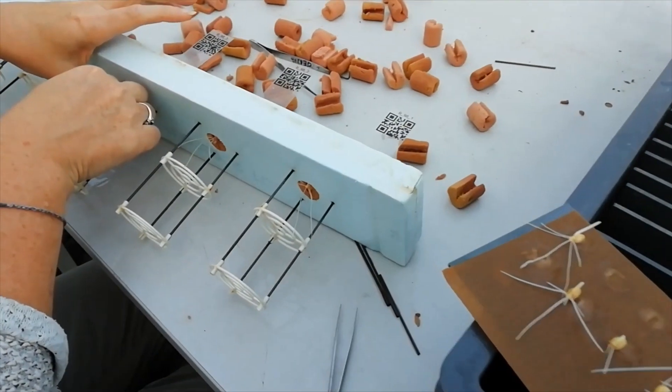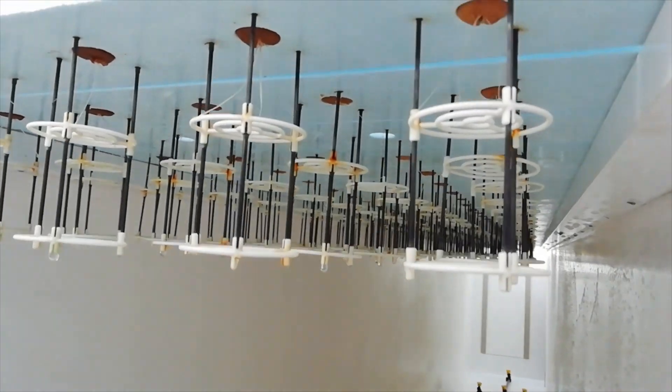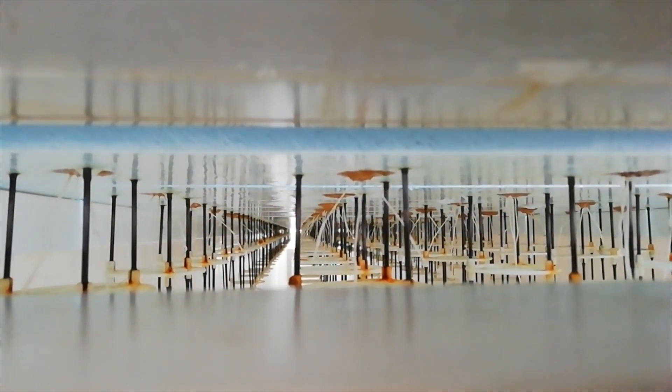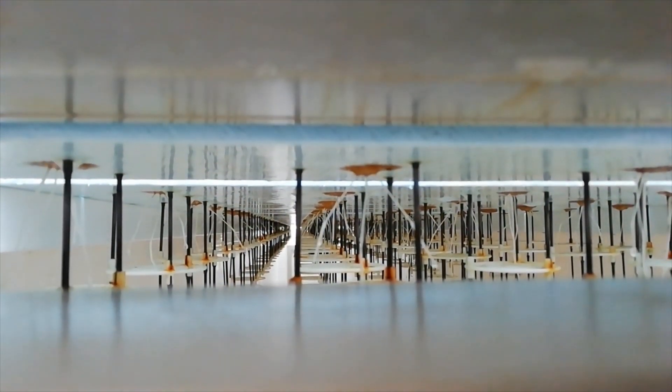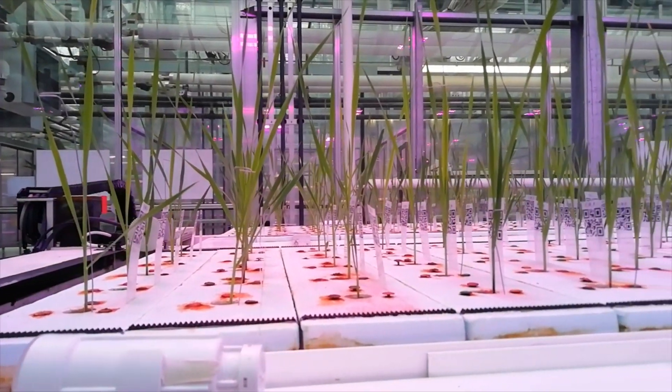The seed's pre-germination was performed for 11 days at 8 Celsius degrees. In this way, a good homogeneity of plant growth was ensured, allowing a presence in the platform of more than 90% of correctly grown plants.